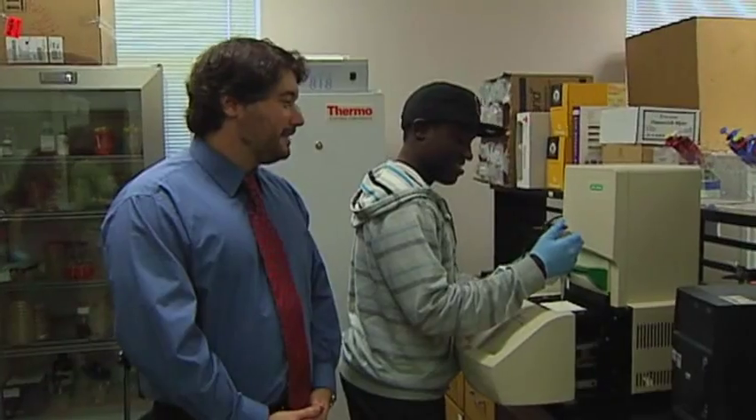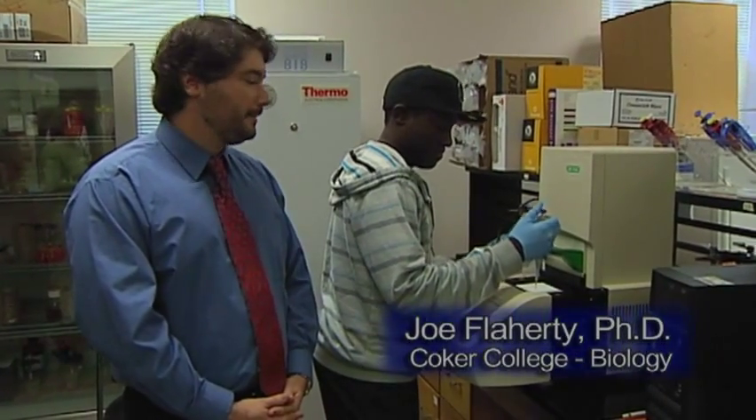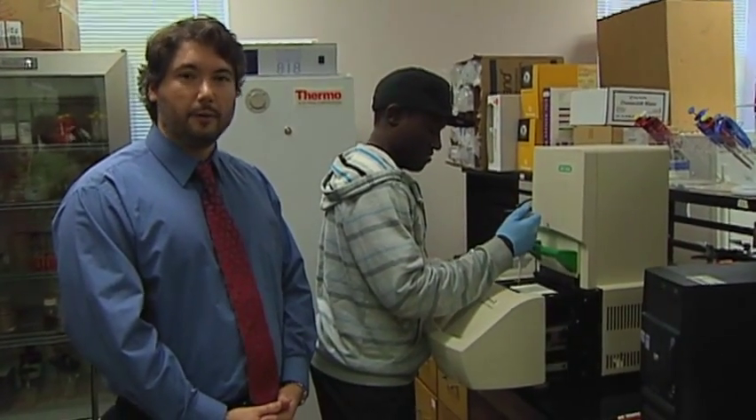I'm Dr. Joe Flaherty and I know biology. This is a Bio-Rad Opticon 2 real-time PCR instrument. This particular instrument is used to examine gene expression on a quantitative level.